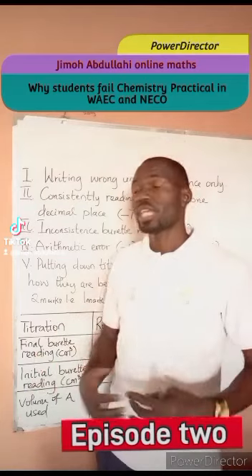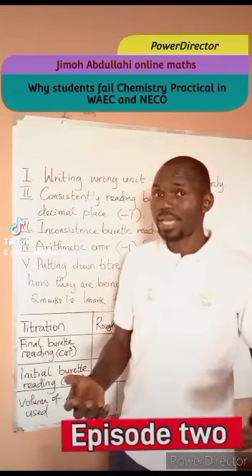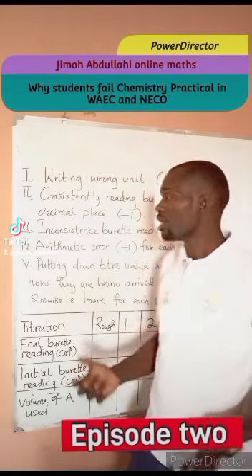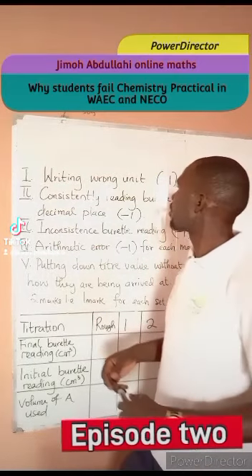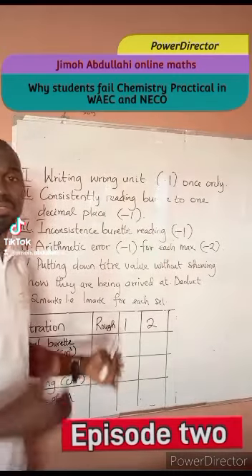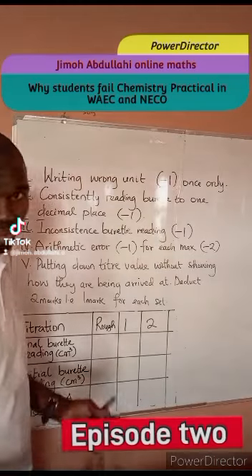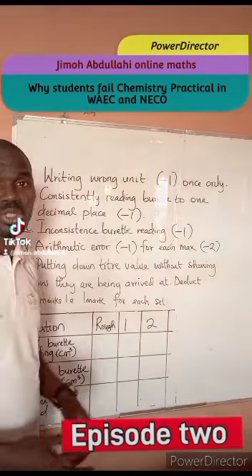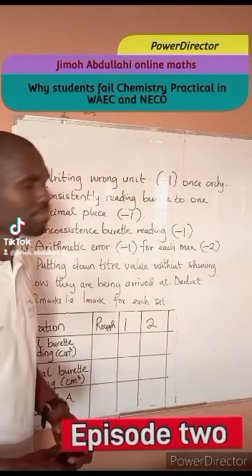In my previous lesson, I showed you some of the errors students make in the WAEC and NECO practical chemistry exam. So this is going to be episode 2 of that lesson. Now, we have some rules and regulations guiding volumetric analysis in NECO and WAEC, as the case may be. There are things that I want you students to know while writing your practical chemistry exam.